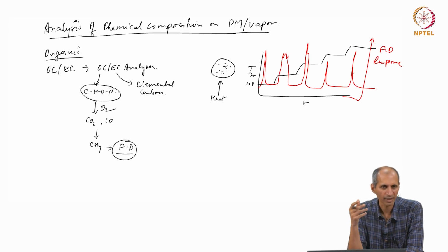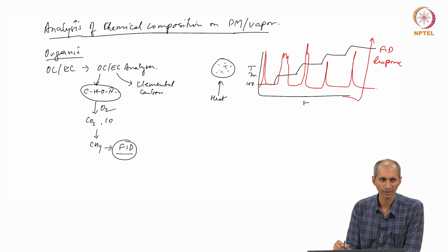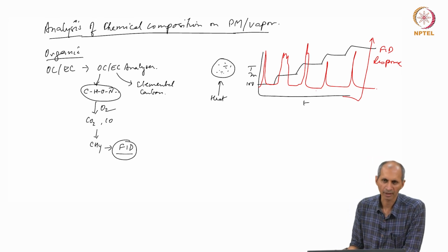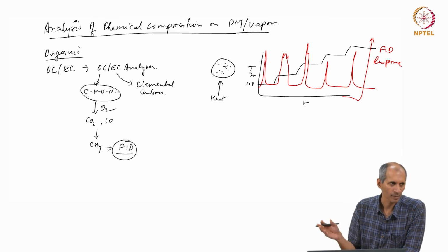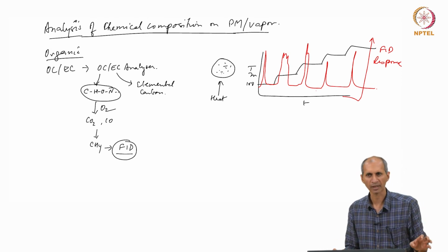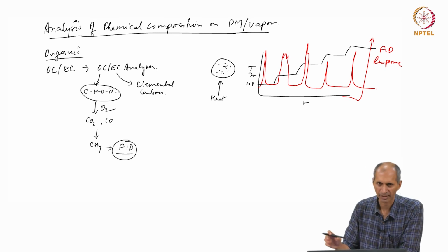So, you are taking fractions. We do not have any idea what this chemical specifically is, but we know that this all constitutes organic carbon. At 500 degrees it will burn off, it will combust with oxygen, and it is coming out and then it is converted to methane, and that methane is measured. You can calibrate it by adding a known amount of organic carbon, and it is measured in terms of signal for methane in the end. So, the calibration is done like that.